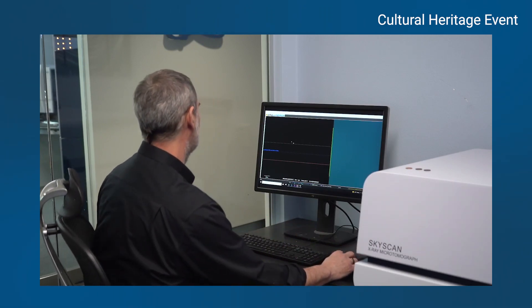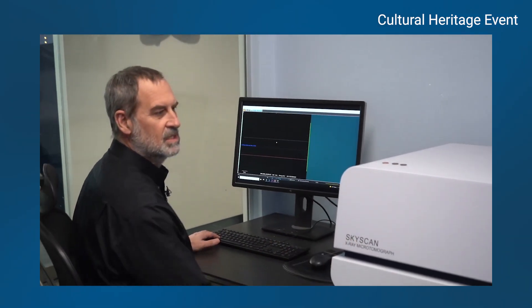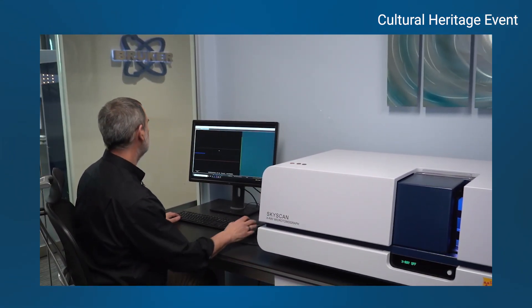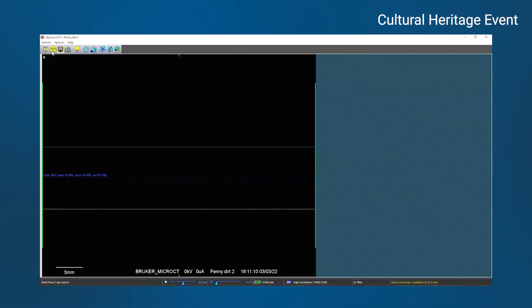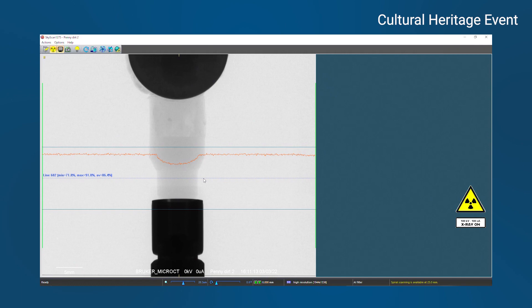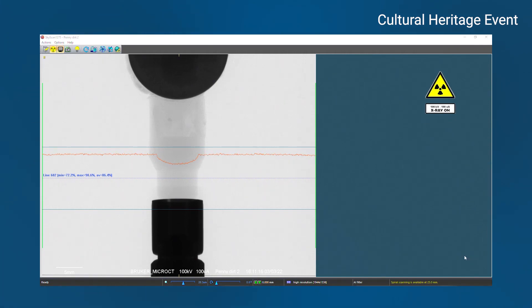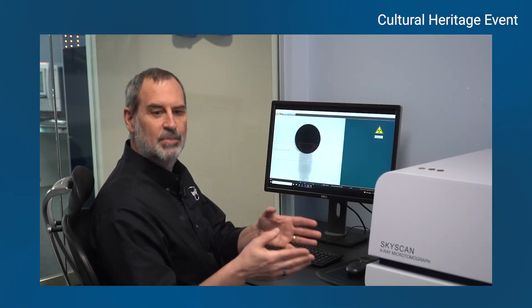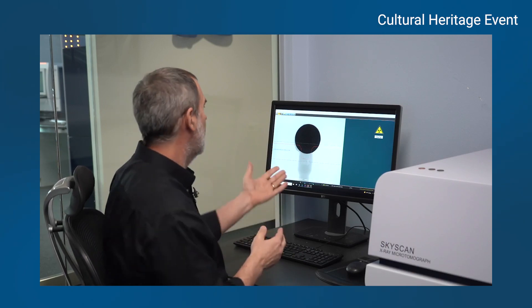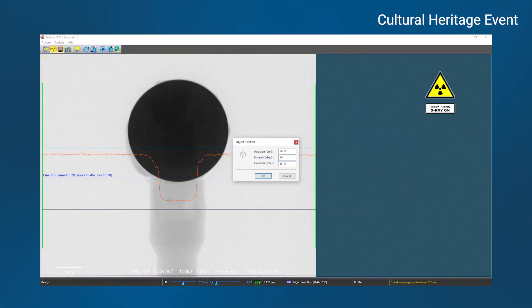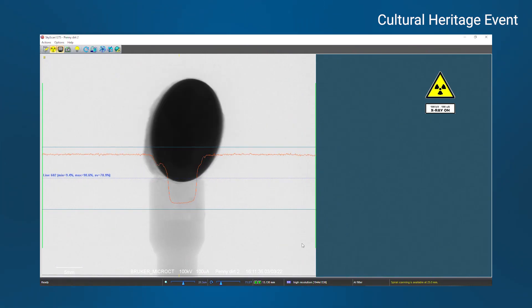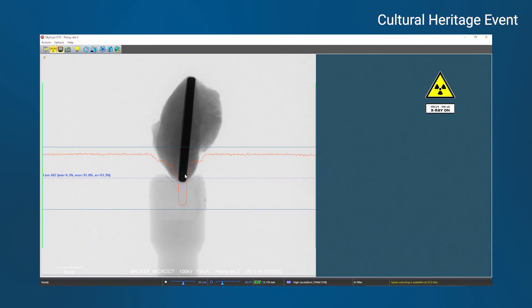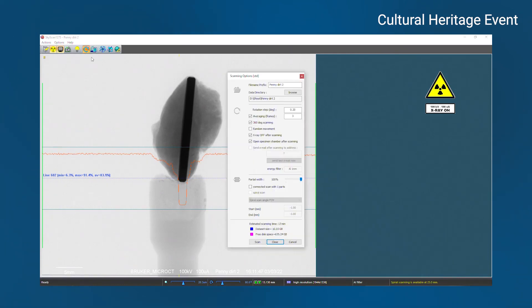Let's close the door — that seals off the room from the X-rays. We can see the X-ray source is on, my light is on, and I have a little yellow icon that says 'X-rays on.' There is my sample, and as you remember in the sample chamber it just looked like a rock, a clump of dirt. But I can immediately see right through it. Let me rotate it quickly — there's the dirt, it's tilted a little bit, but that's not a problem. We're ready to go.